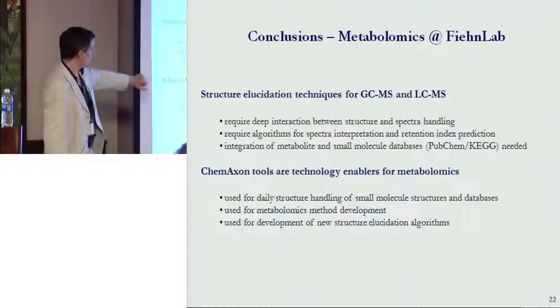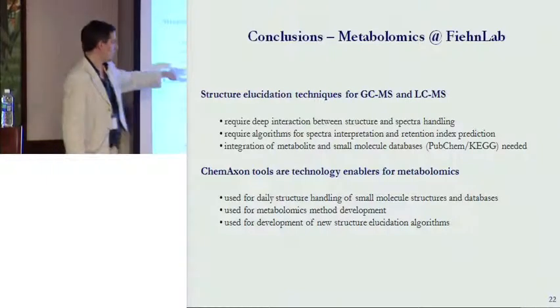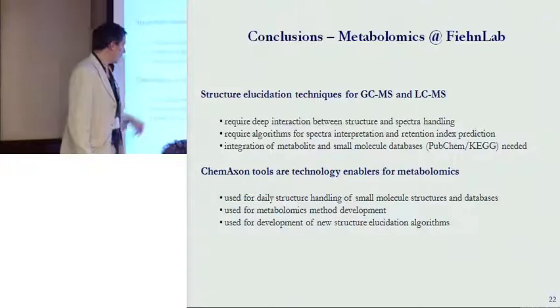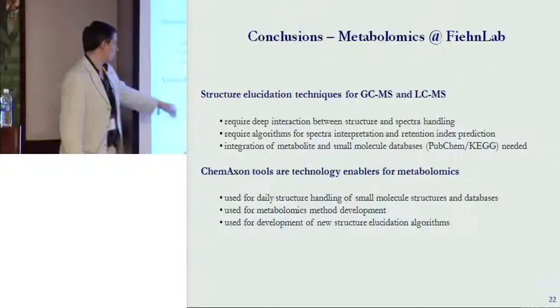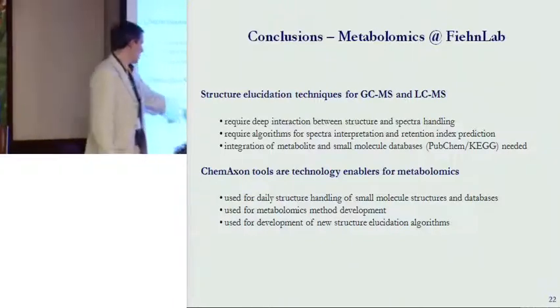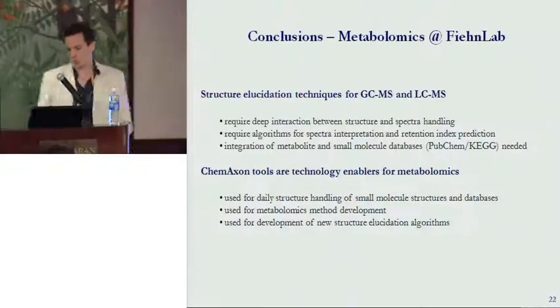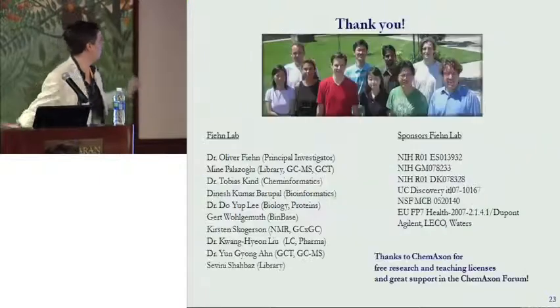And the ChemAxon tools in our case are technology enablers, because only with them can we handle our structures daily. We can use them for metabolomics method development and also for development of new structure elucidation techniques. And here I am at the end.